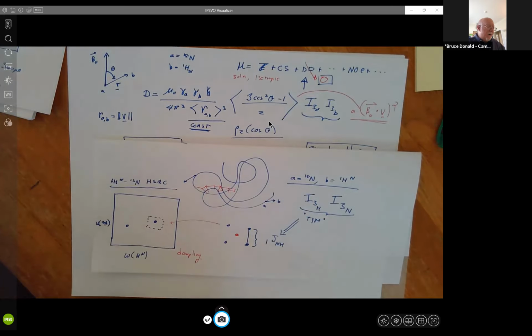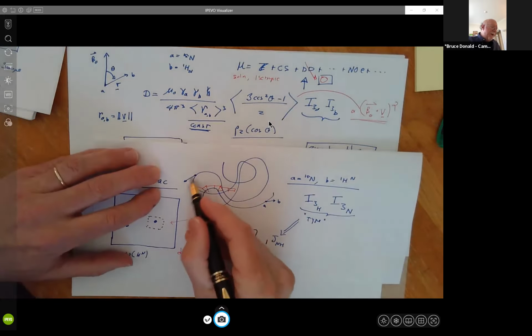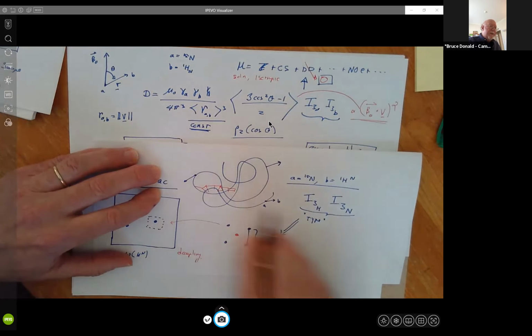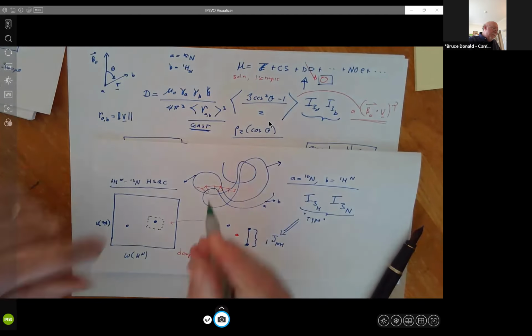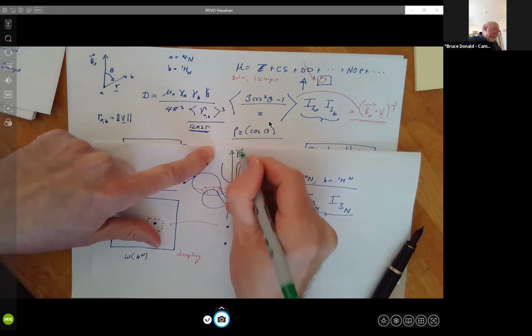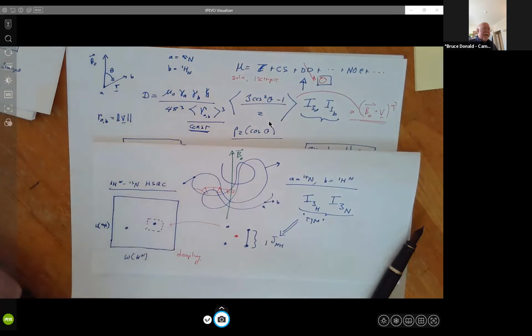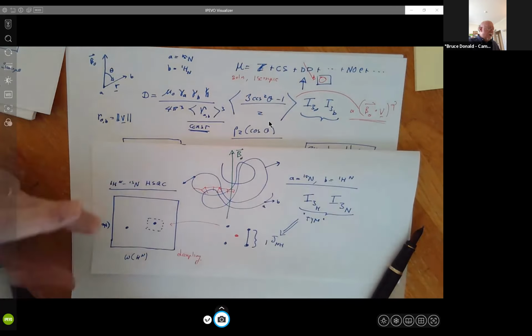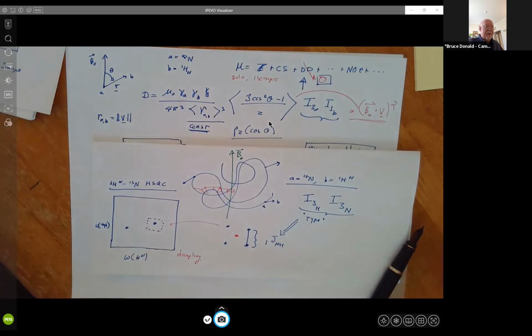The beautiful thing about RDCs is that this bond vector here, this one here, and this one here, you're measuring their orientation relative to the same external huge magnetic field, right? And so you're measuring the dot product of V1 with this, V2 with this, V3 with this, all in the same global coordinate system. So RDCs become much more like data in crystallography or cryo-EM. They're globally referenced.